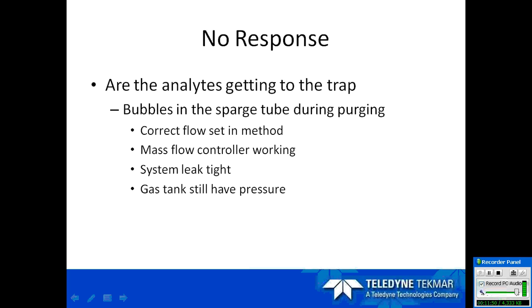For the older systems, you would normally be setting it on your pressure regulator on the front of the system. On the newer systems, such as the Stratum, they have mass flow controllers, so all your flows are set in the software. You will get a read back on the flow in the software, but you will also still be able to measure that flow out the vent.